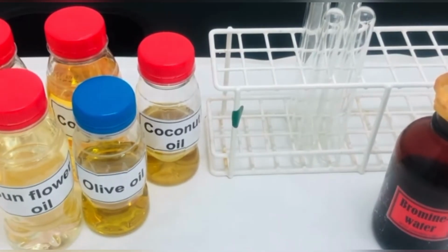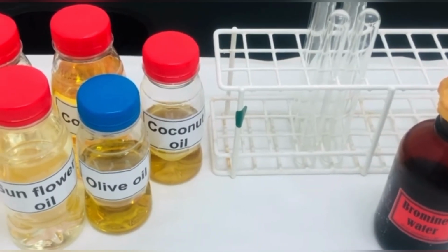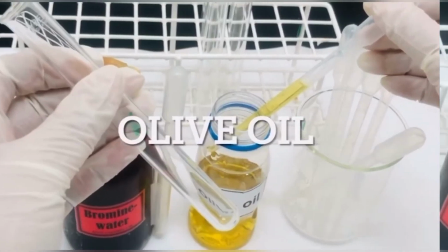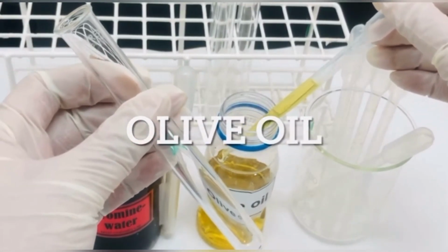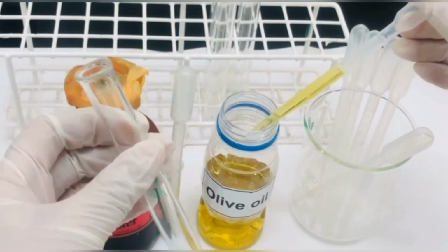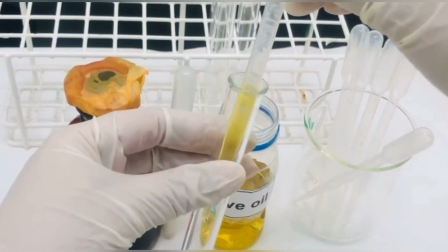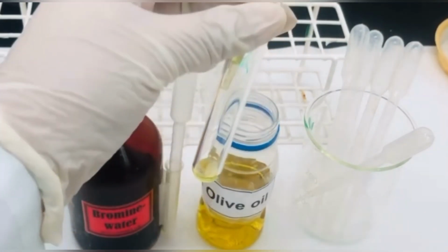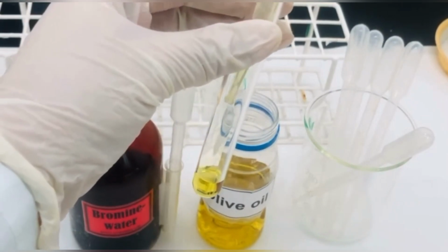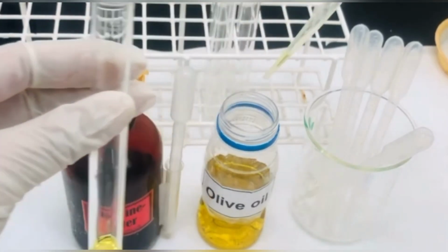In addition to this, we will be requiring things like test tubes, droppers, etc. For the experiment, we will take around 1 ml of the oil sample. We have chosen olive oil over here. And we have taken around 1 ml of the oil sample.